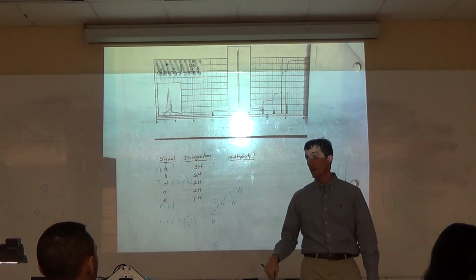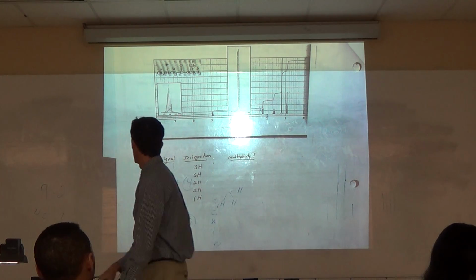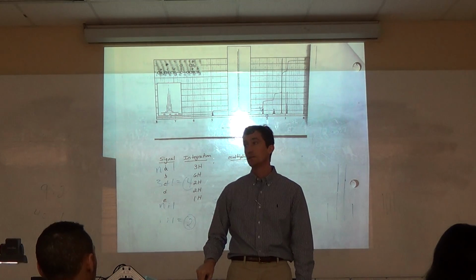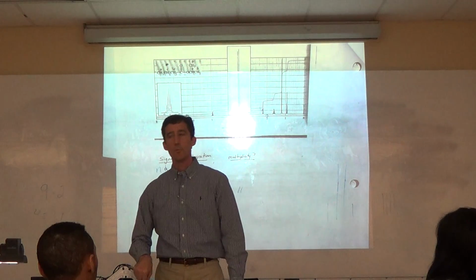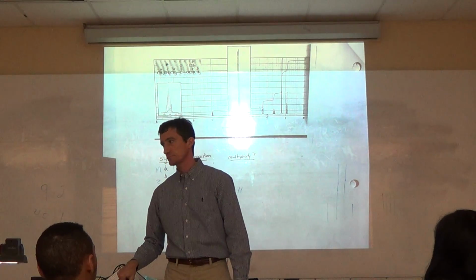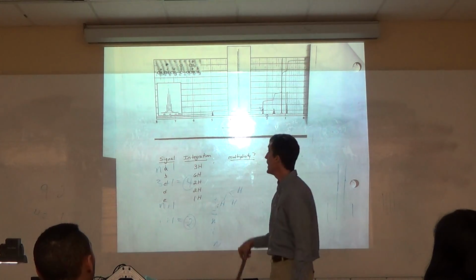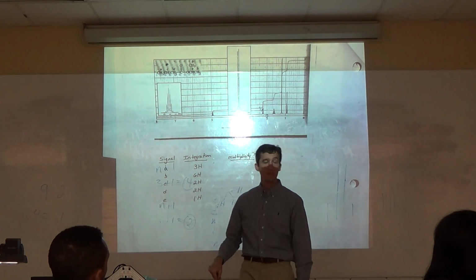C. How many neighbors within 3 sigma bonds? 5. You've got 3 on the one side, 2 on the other. What do you expect? 6. N plus 1 is 6. You would be wrong. Why are we wrong in this case? What did I underline in the rule? N plus 1 rule. No, I underlined another word: equivalent. Are these neighbors and those neighbors the same? Doesn't work.